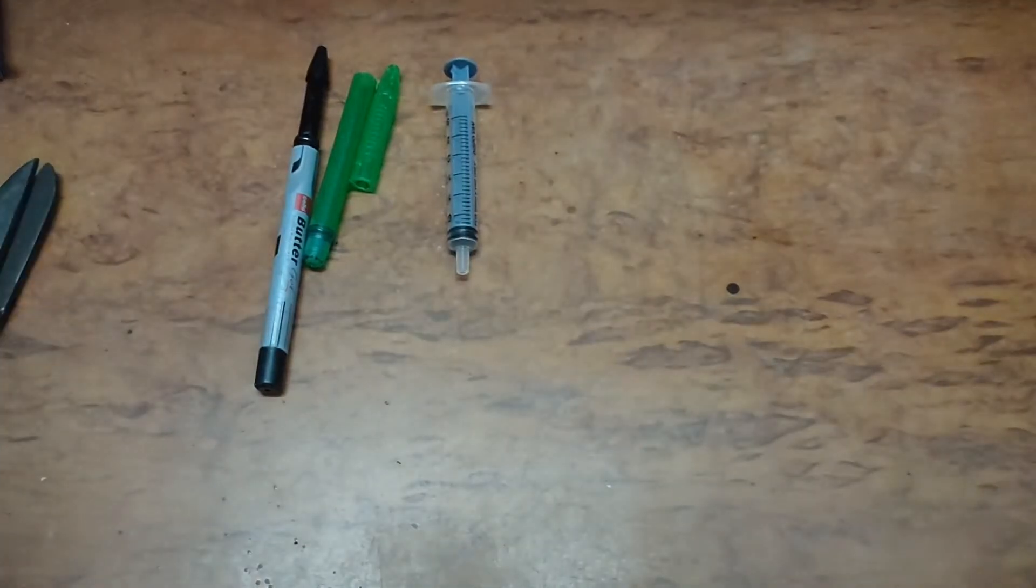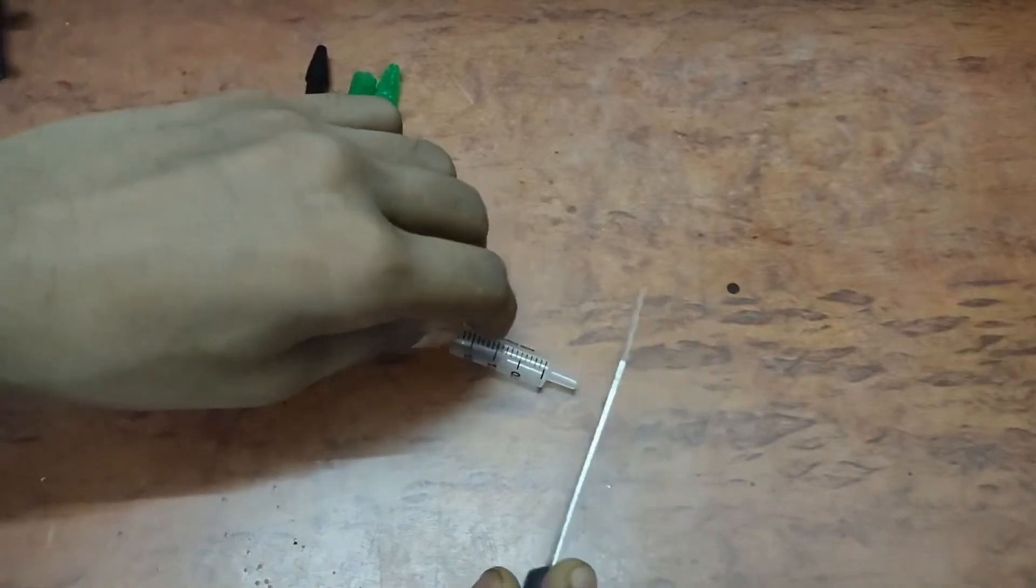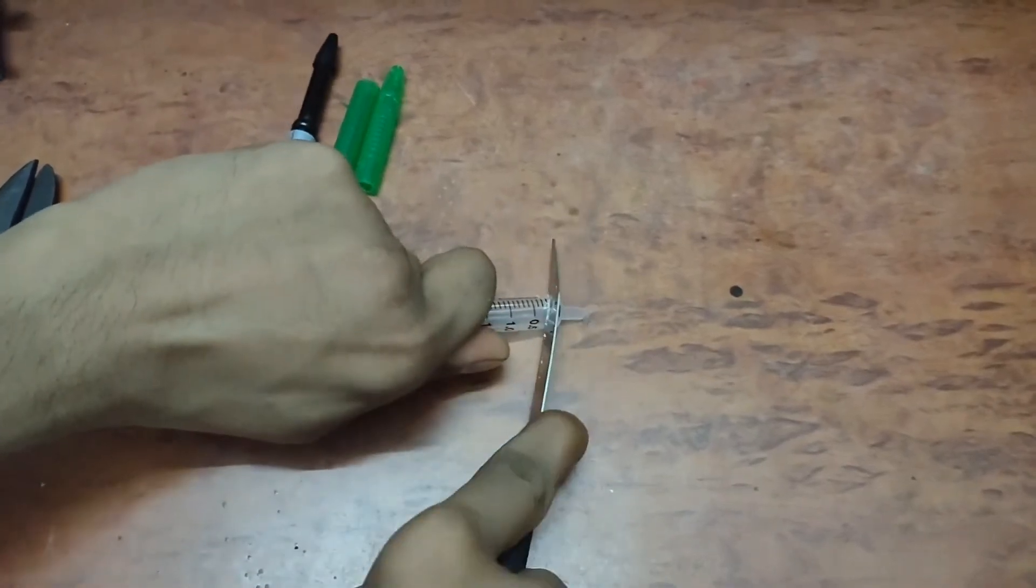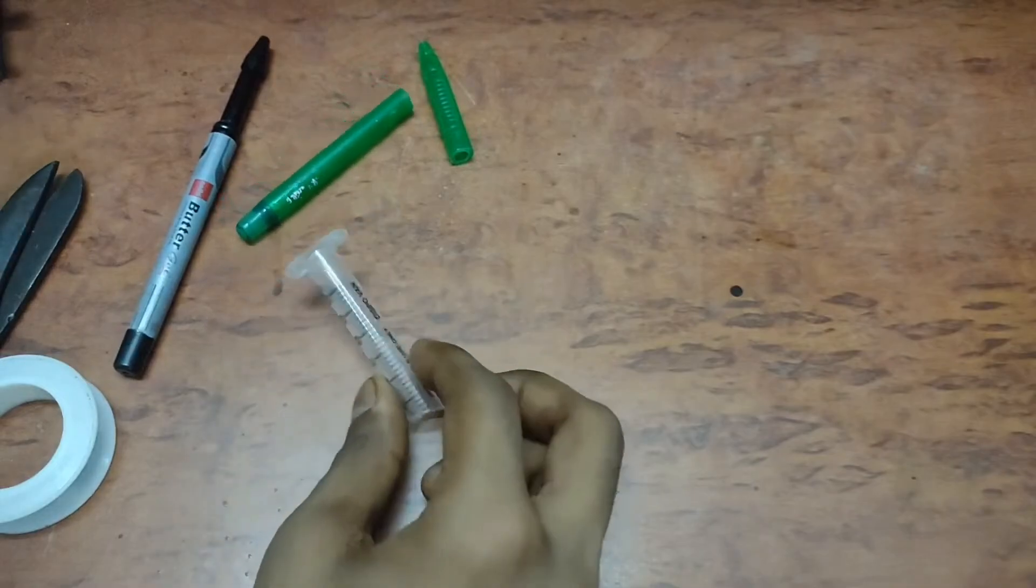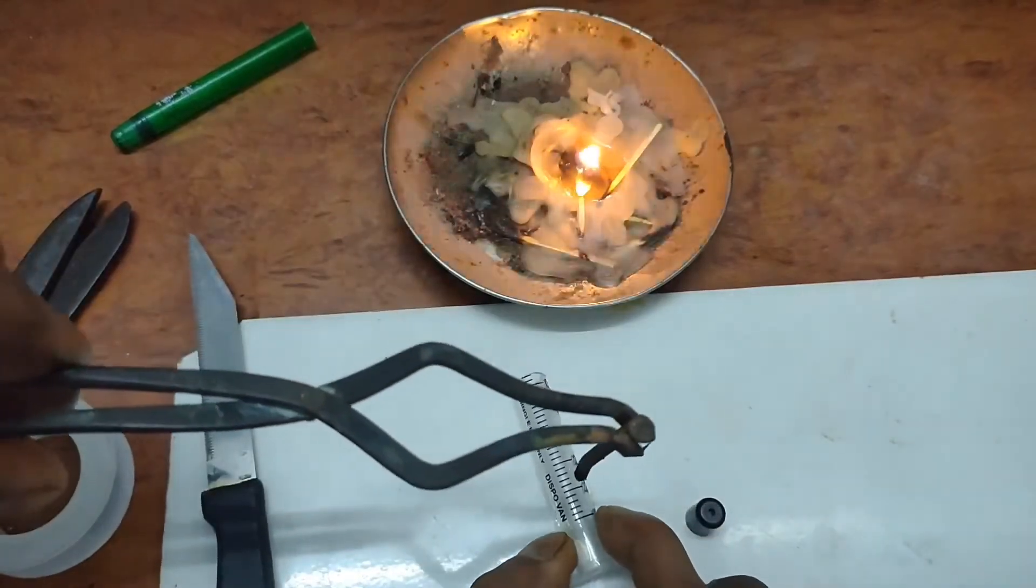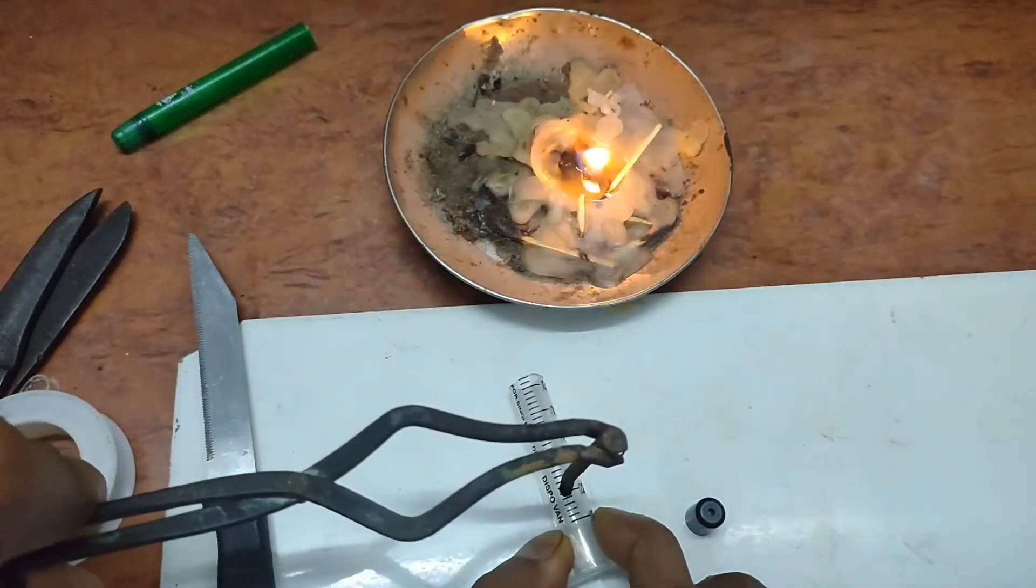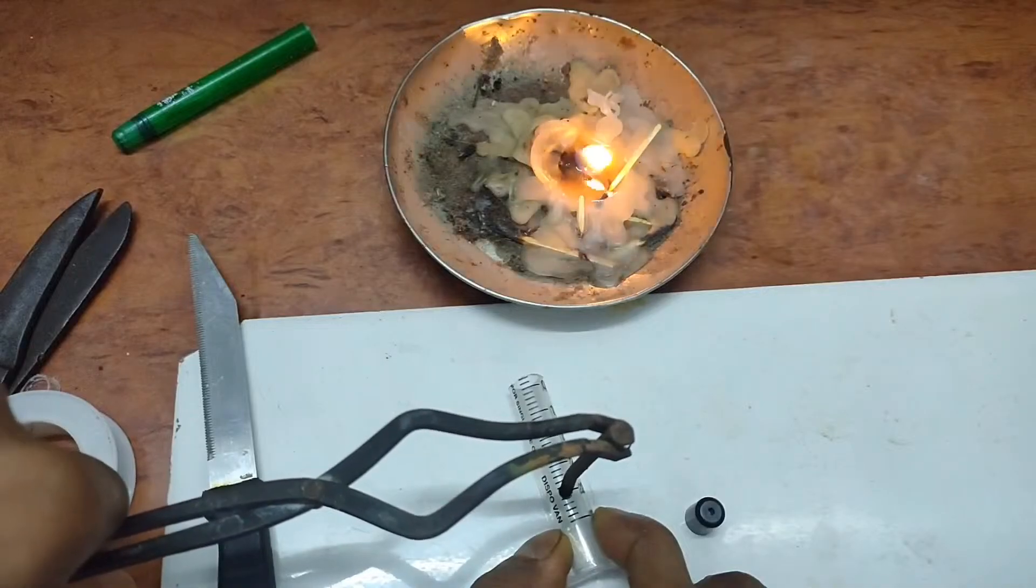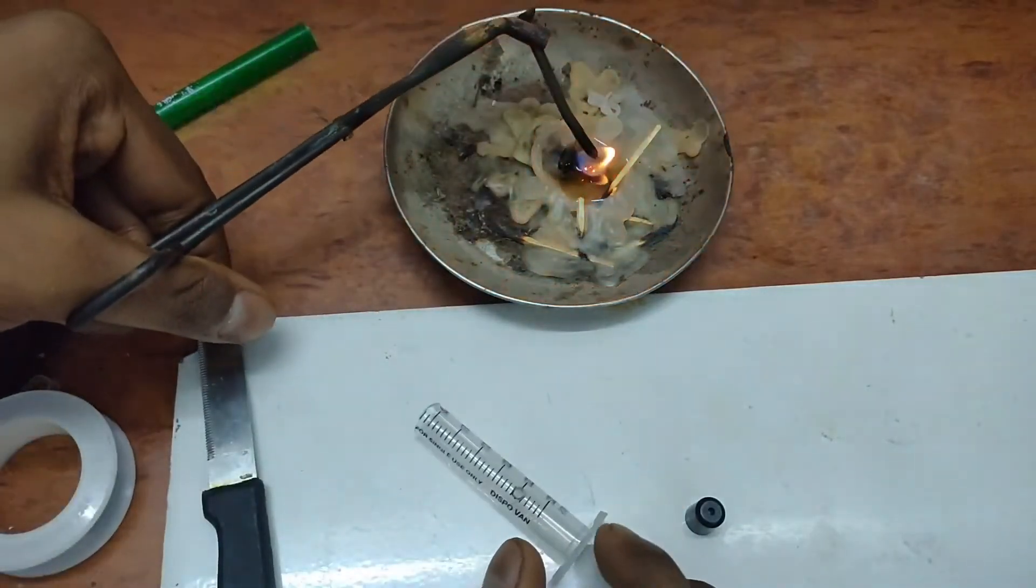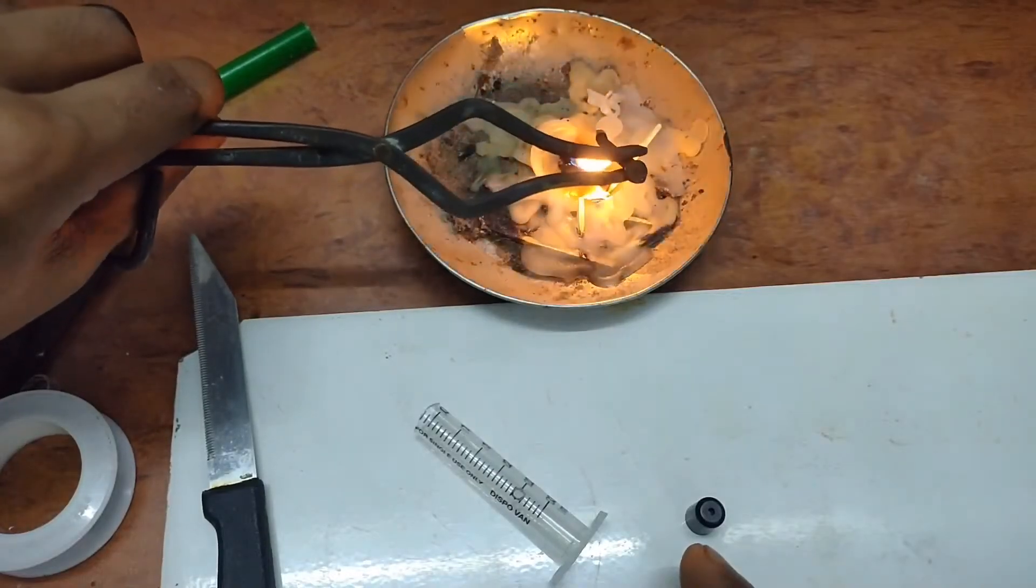First I will take the syringe, take out the plunger and cut the front with a knife. Now I will be making a hole inside the syringe at the 2.5ml mark with this hot iron nail, and also I will be making a hole in this cap with the hot iron nail.